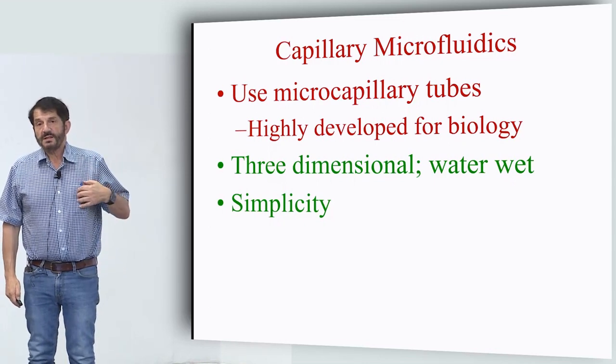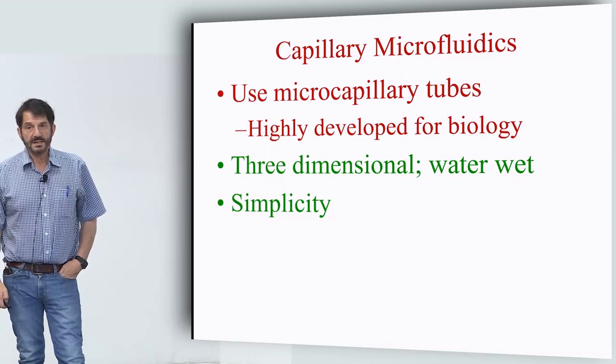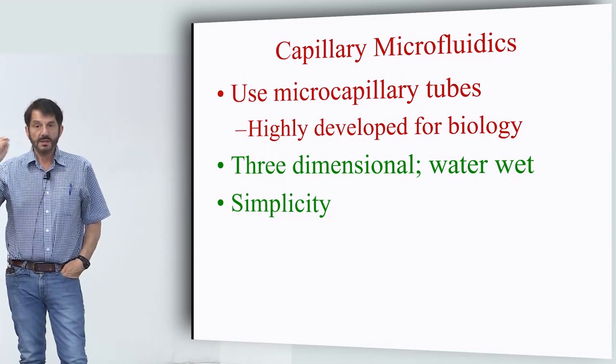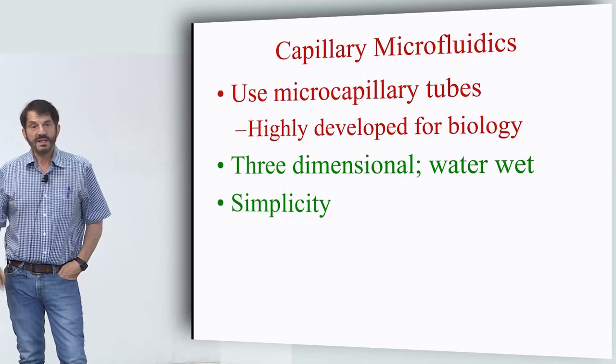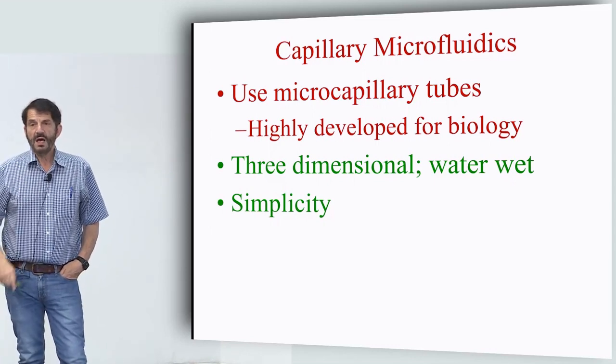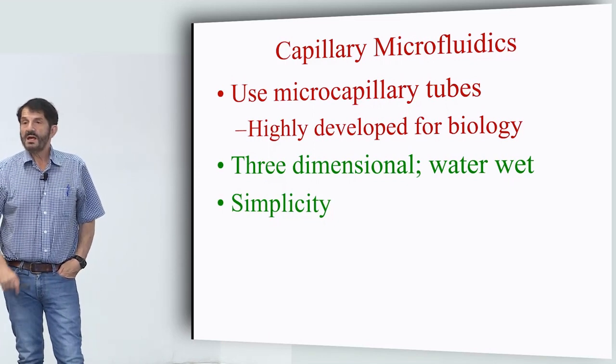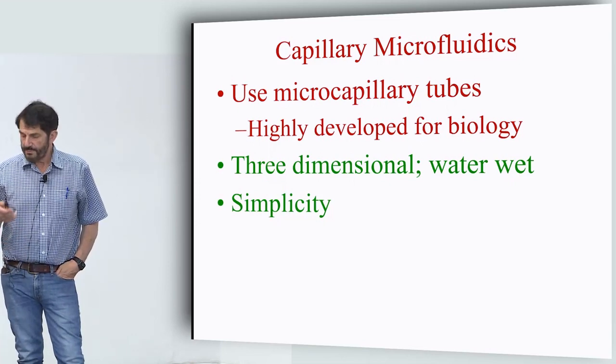And he has invented this really wonderful technology of soft lithography that uses PDMS, that uses silicone, essentially, to make devices. It's a fantastic technology, and in my mind, it really democratized microfluidics by making it really accessible and easy to use, easy to make structures for everybody.